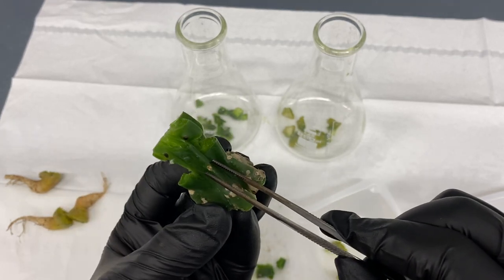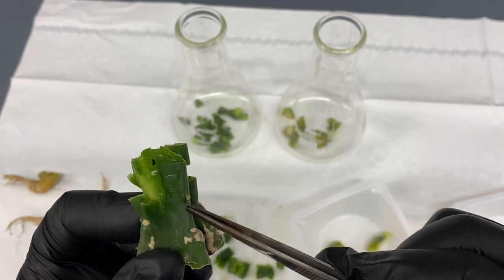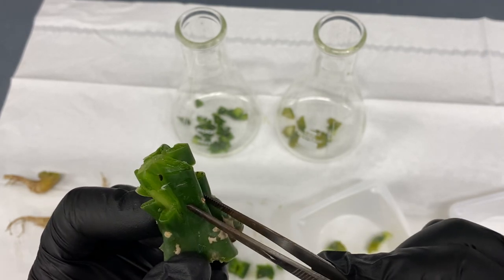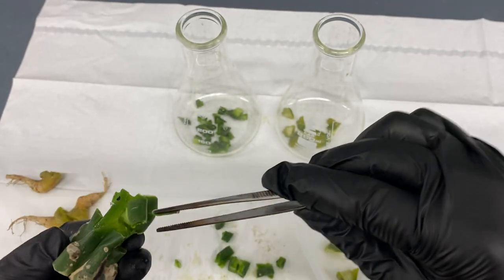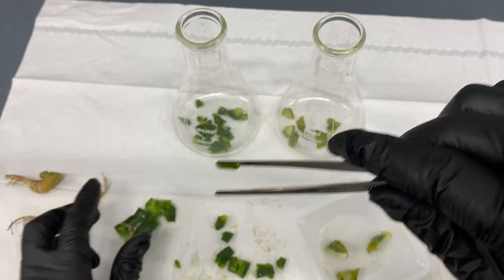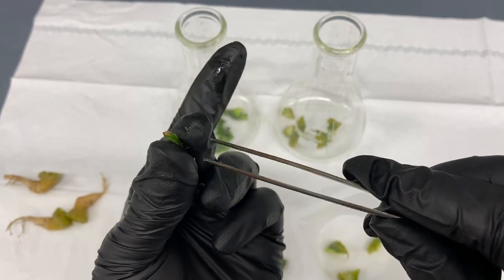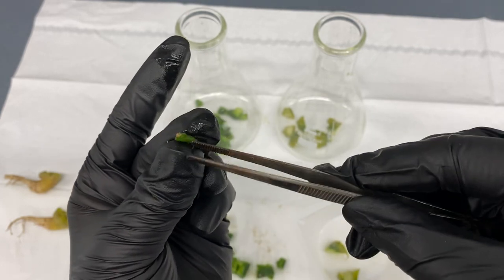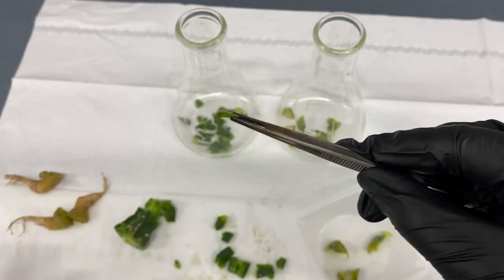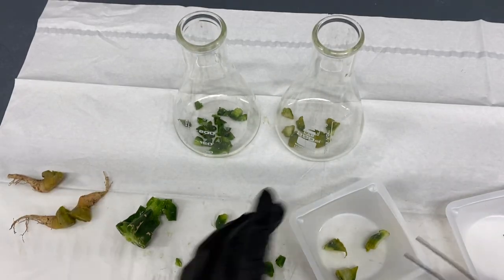This applies to columnar cactus or euphorbia — each growth point comes from where the spines are, so this is a good spot. You could cut that with scissors, but just to show you — that's the growth point. That's really where the meristematic core is, and what will regenerate a new cactus.